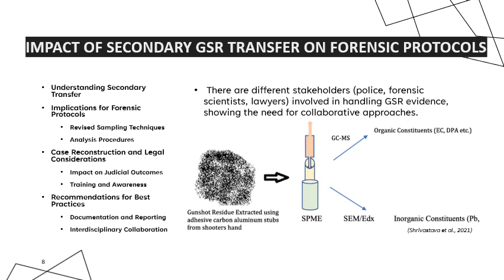Now, the diagram from Shrivastava and their associates in 2021 shows how gunshot residue is extracted. There are many different methods to extract and analyze gunshot residue. SEM-EDX is mostly for the inorganic constituents of gunshot residue.